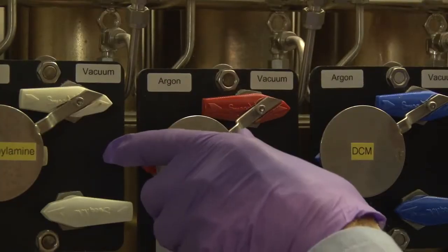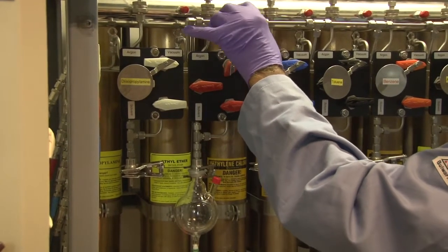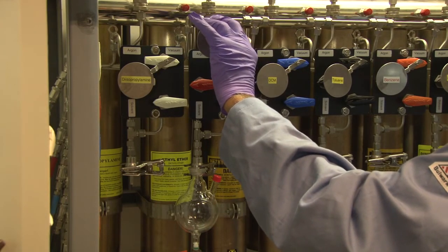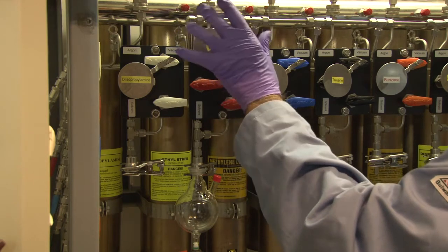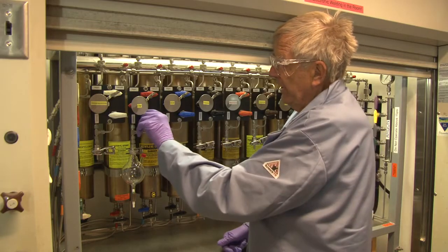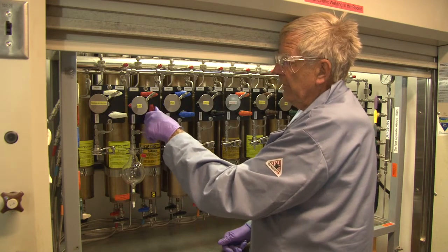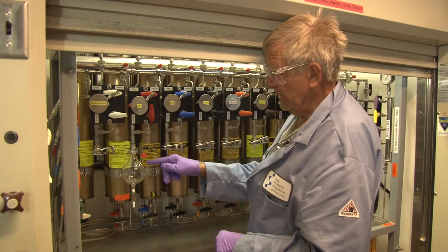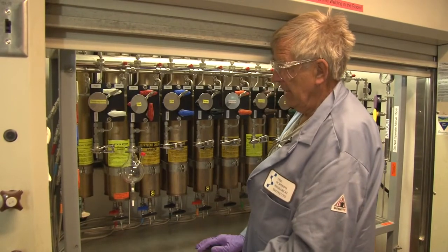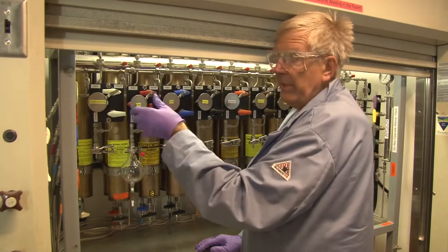If you switch this over to argon — this represents your Schlenk valve on a double-oblique manifold — this is argon/vacuum, same principle. If I turn this to vacuum, that will turn the pump on. When evacuating the flask, this has to be set to vacuum. Then you open this valve, which in turn will turn on the pump. You are now evacuating this flask, and you Schlenk back and forth as many times as you like.